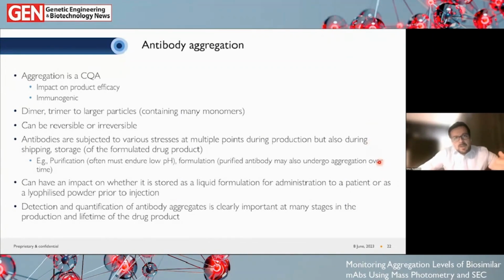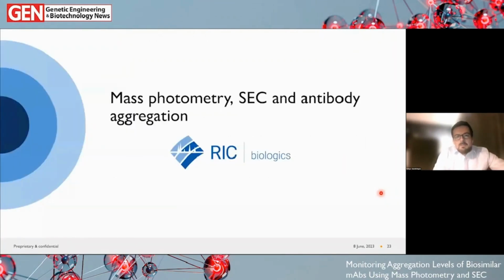So basically, the main message is that detection and quantification of these aggregates is clearly important at many stages in their production and during the lifetime of the drug product. If we shift over, we'll have a look at the biosimilar study that was completed by RIC Biologics. Our RIC group have been around for over 35 years, and they provide a range of in-depth analytical services to the biopharma and biotech sectors. We have a lot of expertise where SEC-based approaches are concerned, and also mass spec.